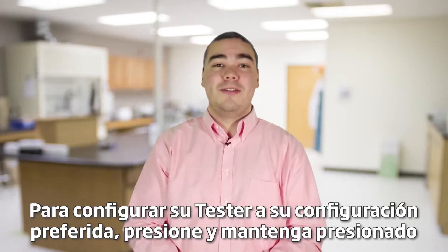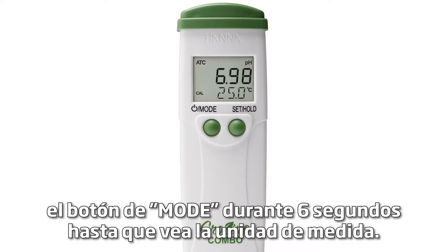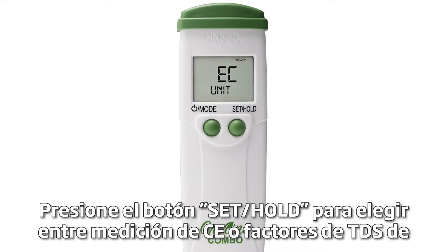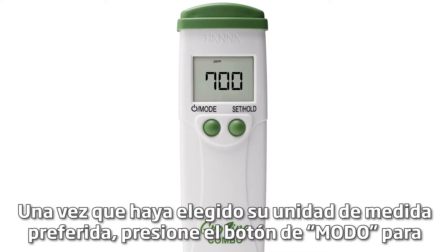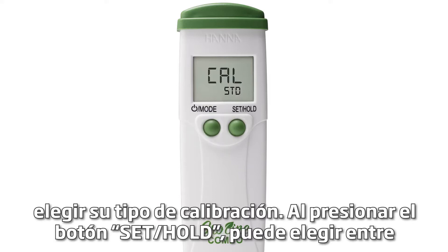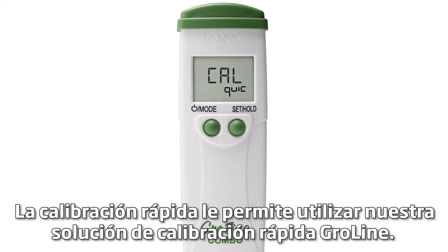To set up your tester to your preferred settings, press and hold the mode button for six seconds until you see the unit of measurement. Press the set hold button to choose between EC measurement or TDS factors of 0.5 (500 ppm) or 0.7 (700 ppm). Once you have chosen your preferred unit of measurement, press the mode button to choose your calibration type. By pressing the set hold button you can choose between Cal standard and Cal quick.